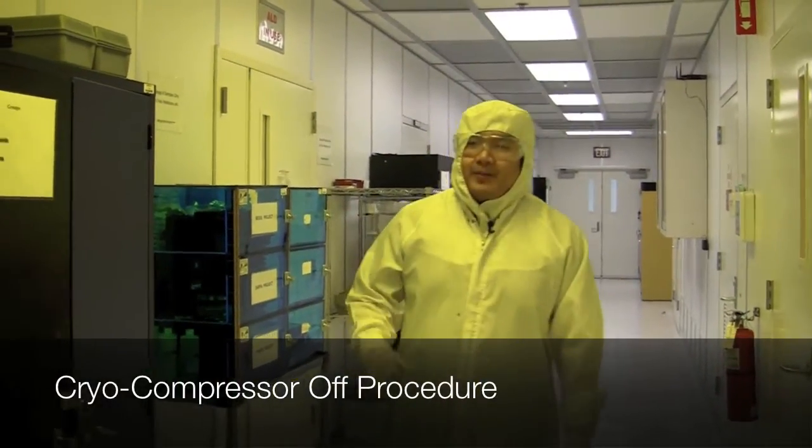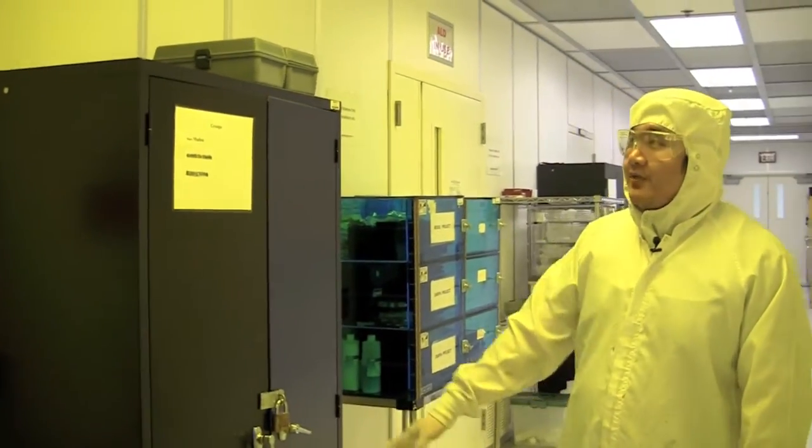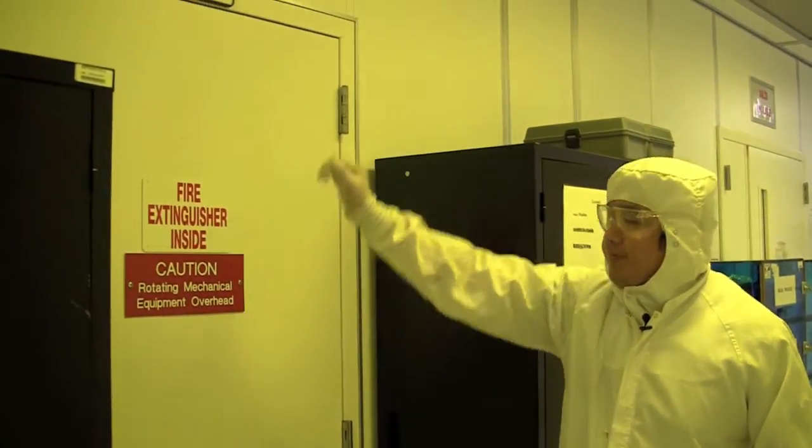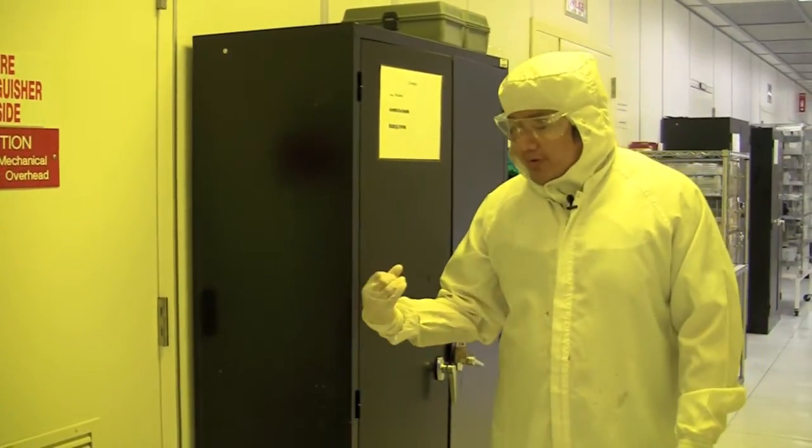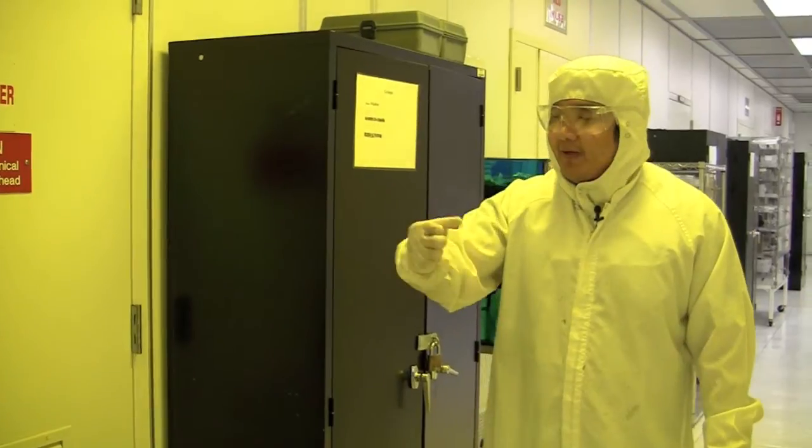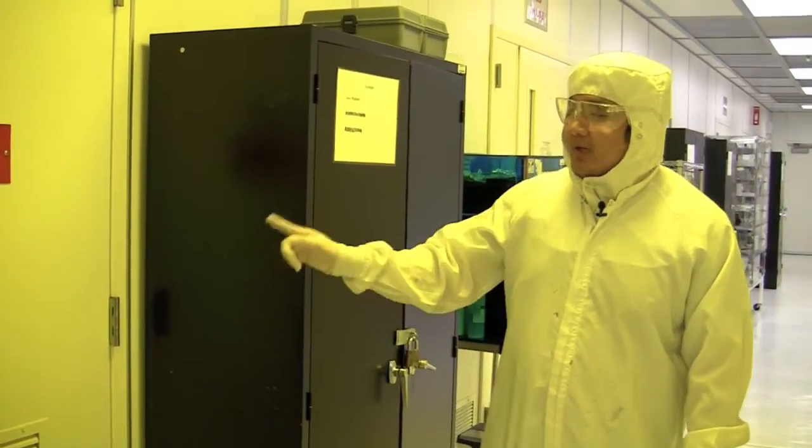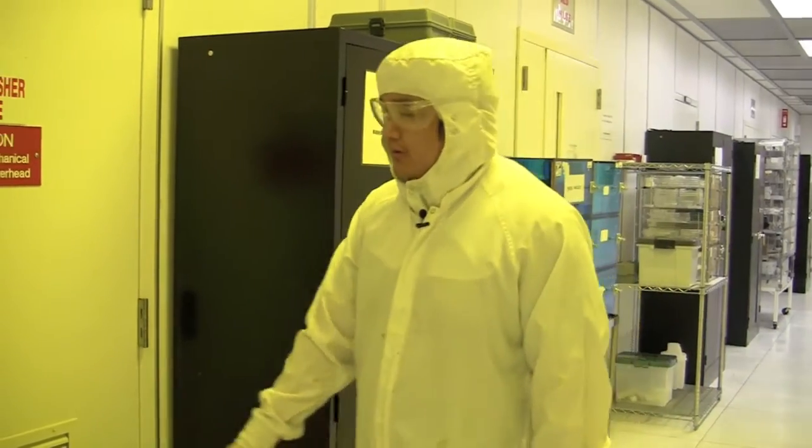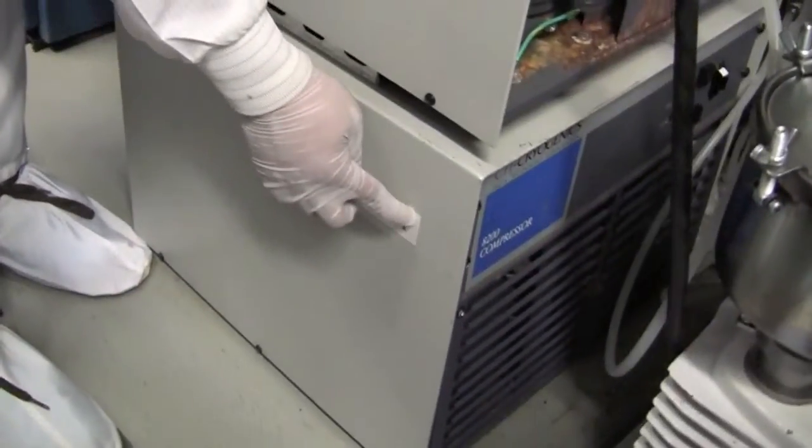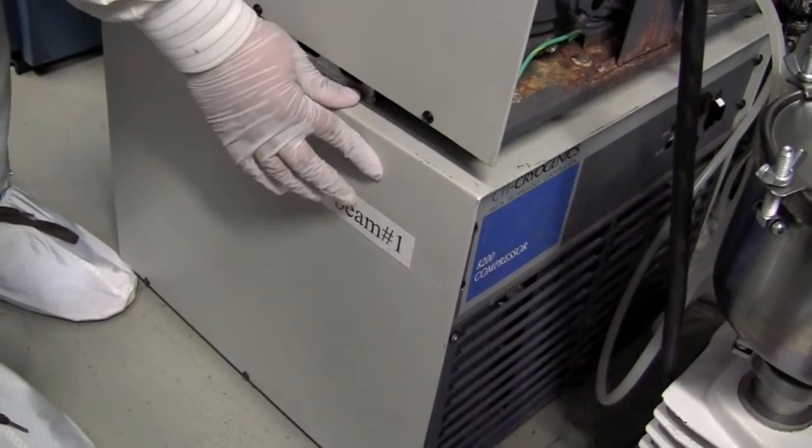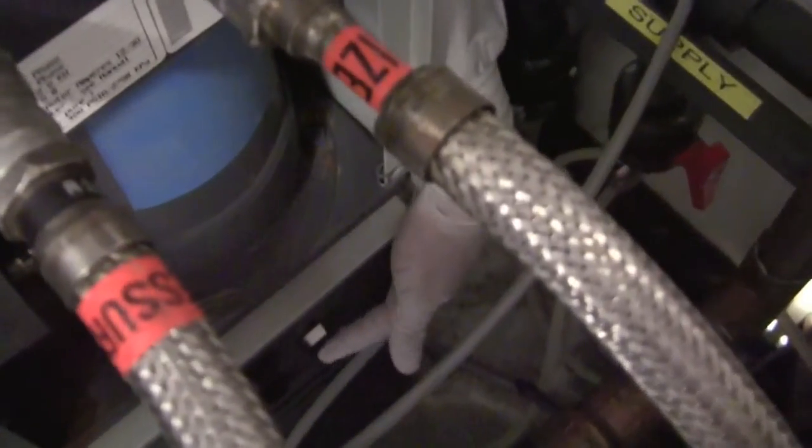In case the cryo pump has been dumped, you want to make sure you turn the compressor off. The compressor is found in this chaser's room 2337 and before you go in you want to make sure there's no odors or chemical spills. If there is then you will notify staff but it looks like it's fine to go in. This is the compressor for the E-beam 1 cryo pump, so it's labeled E-beam 1. If the cryo pump is dumped you need to turn the switch off, and then you notify staff and let them know that the system has been dumped.